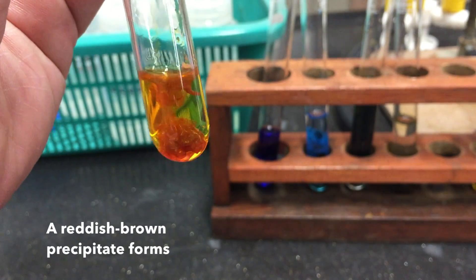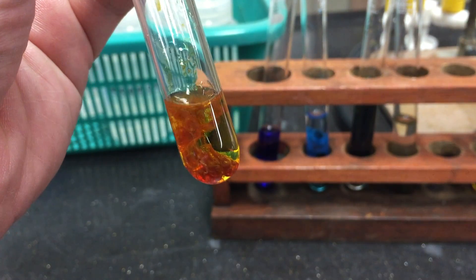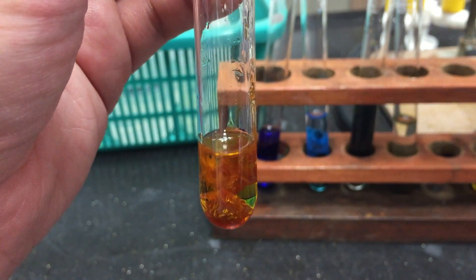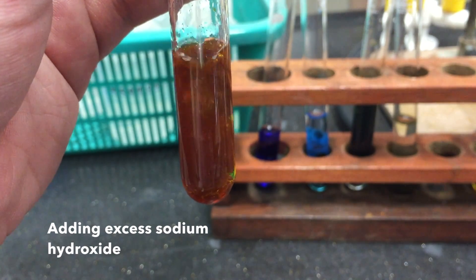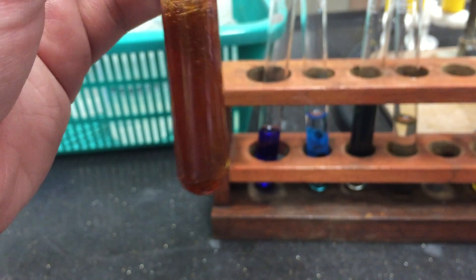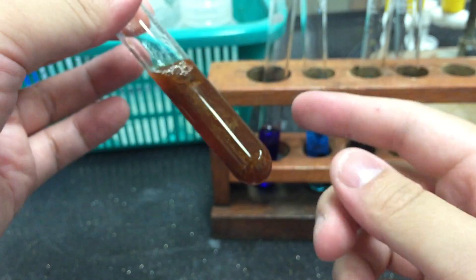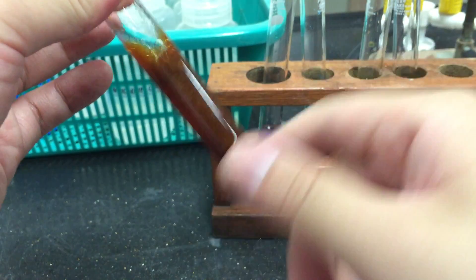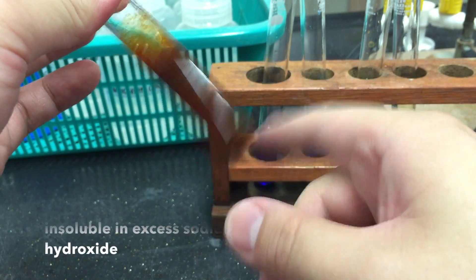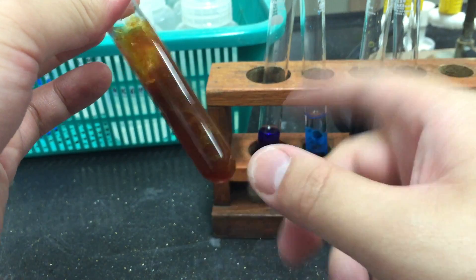You will notice that a red-brown precipitate forms. Proceed to add excess sodium hydroxide solution. Notice that the red-brown precipitate remains insoluble in excess sodium hydroxide.